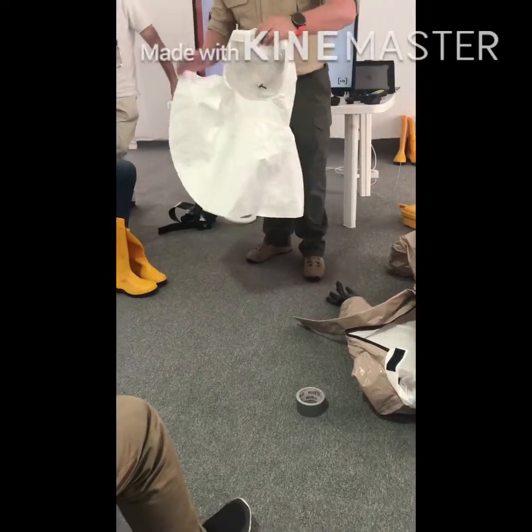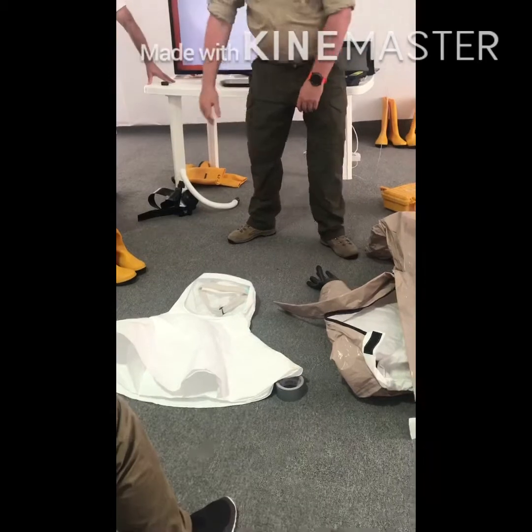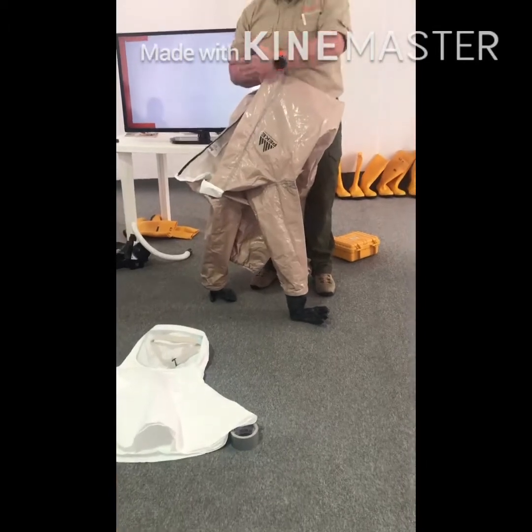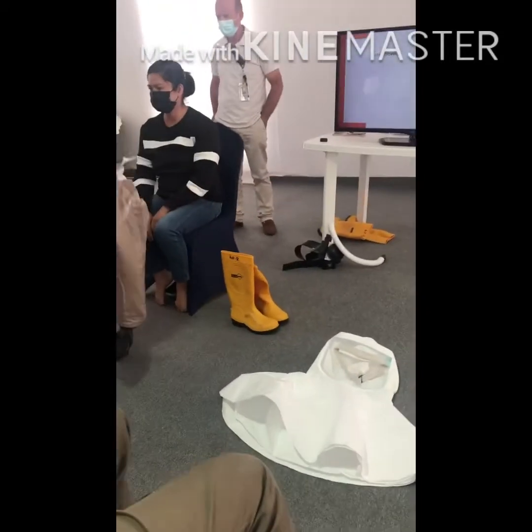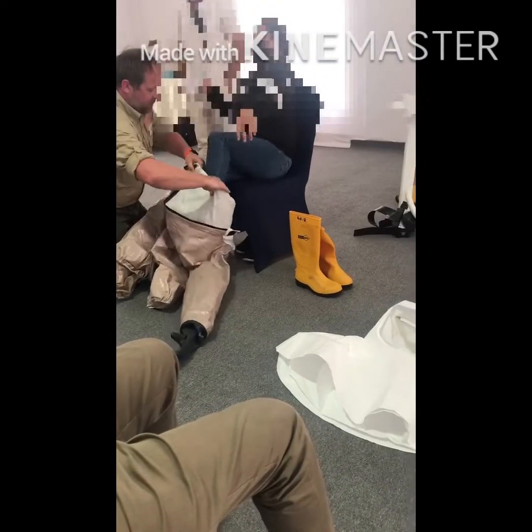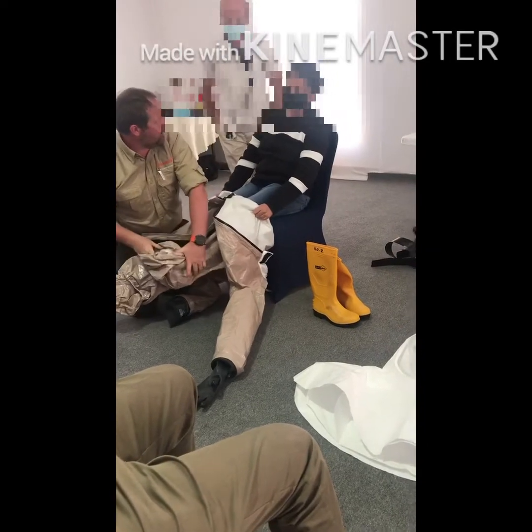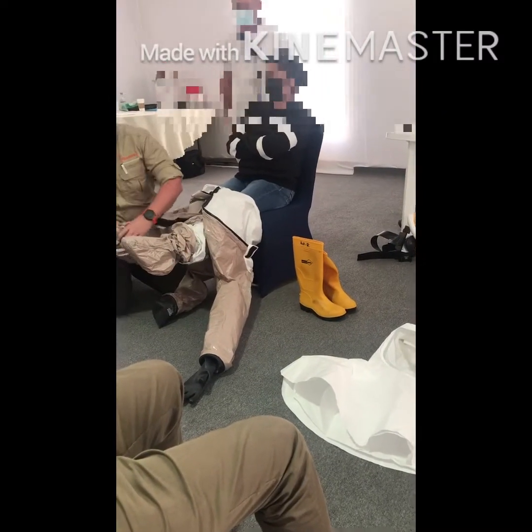So once we're happy we've checked everything, we can now start to get dressed. Sit forward for me. I'm now going to be the second person who's going to help her get dressed. I'm going to get the suit, open it up, and offer her to put her left leg in. You put your left leg in there, please. And your right leg. I'm going to make sure, sorry if I touch your feet, if you're ticklish, because these ones have little socks in them, that her toes are all the way to the end of those little socks. Like so.